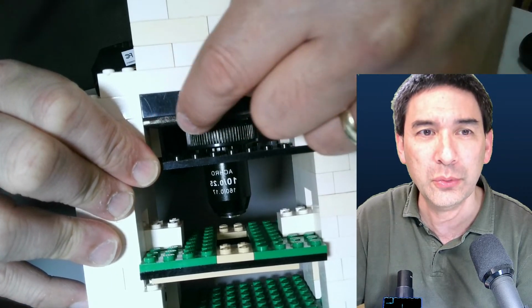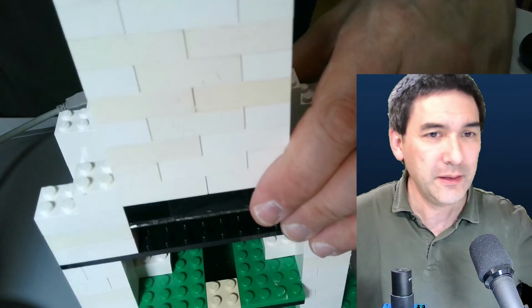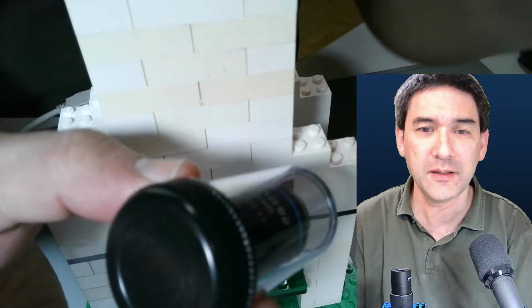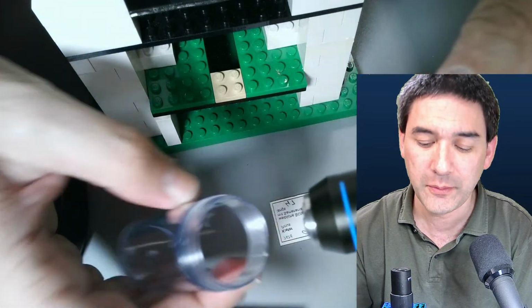I used some hot glue to glue it to the Lego, but the objective is held in place over a little cap. Look at this here, what I got here. Yeah, this is... put it down. That's how objectives are also sold.